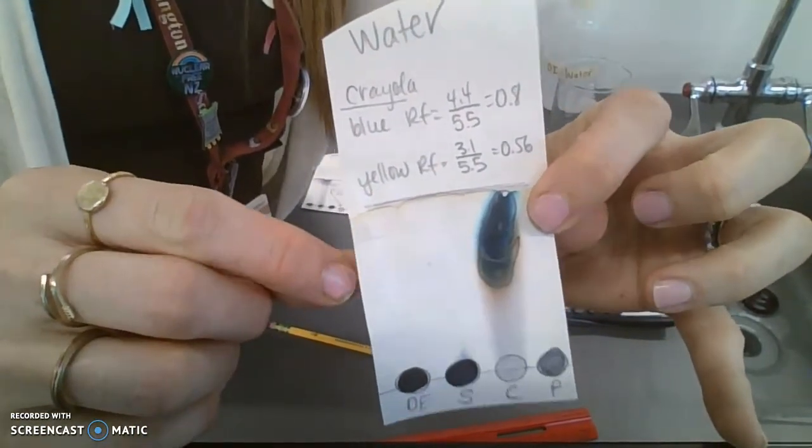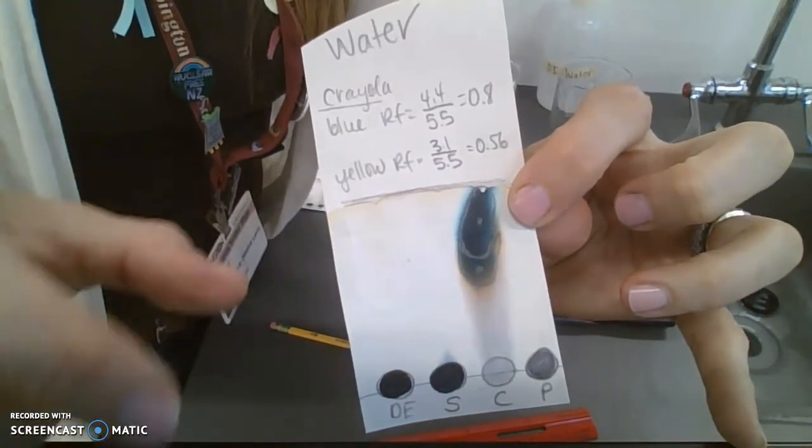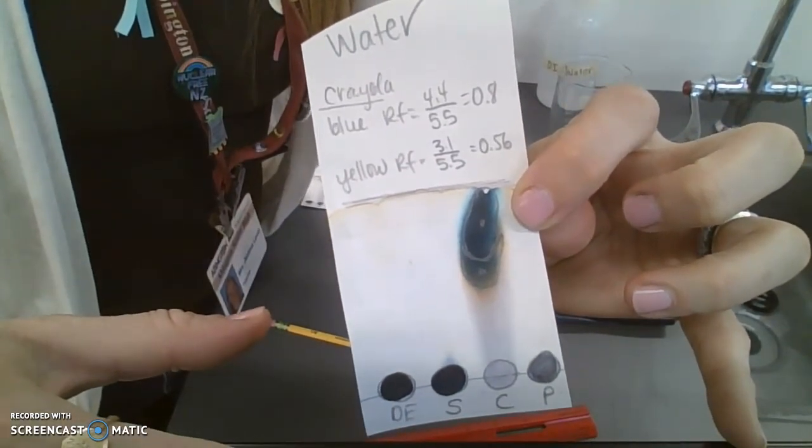So here we have our analysis of the two different pigments in the washable Crayola marker.